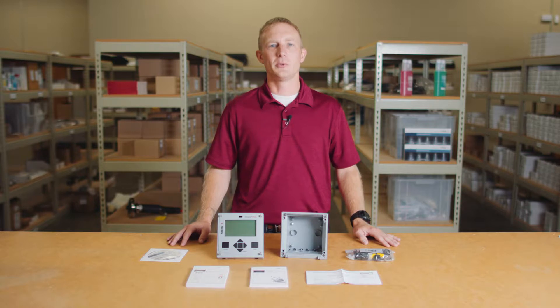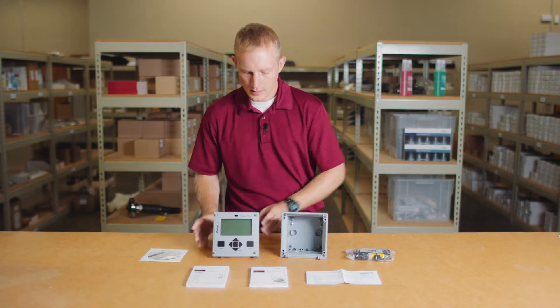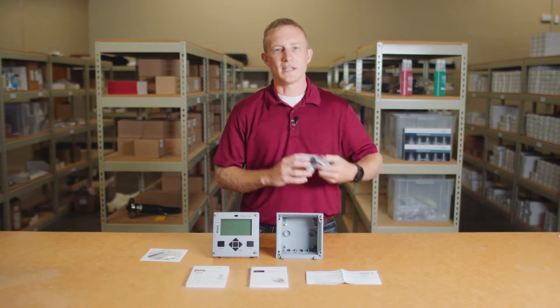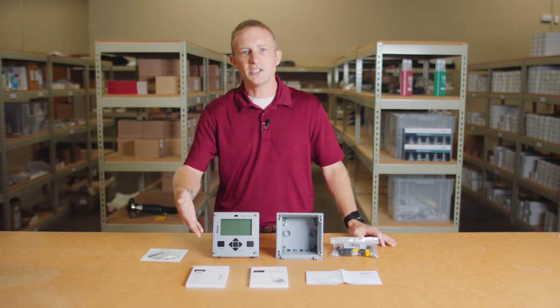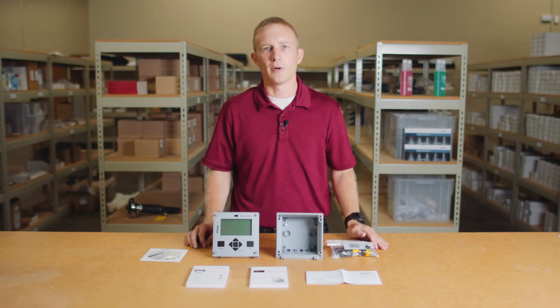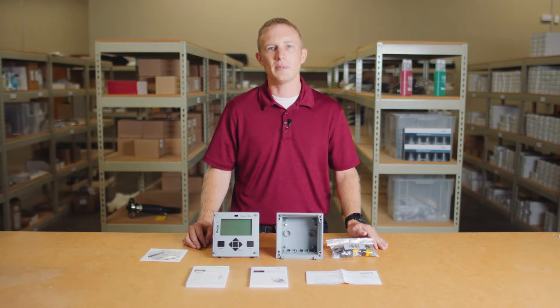Let's take a look at what's inside the box when you receive your Stratus Evo transmitter. We have the transmitter faceplate, the enclosure which is rated NEMA 4X, an accessory bag with plugs, cable glands, and the hinge pin for the transmitter. Documentation includes the manual, safety instructions, and a test report for the transmitter. Finally, we have a CD-ROM which includes electronic copies of all the documentation as well as device drivers and DTMs for the Stratus Evo.